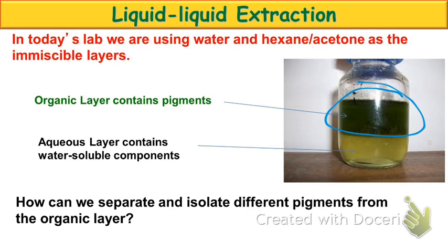Okay? And then what we'll do is instead of letting the solvent run up through it, we're going to turn it upside down. We'll let the solvent run down through it. And that's going to be our separation.